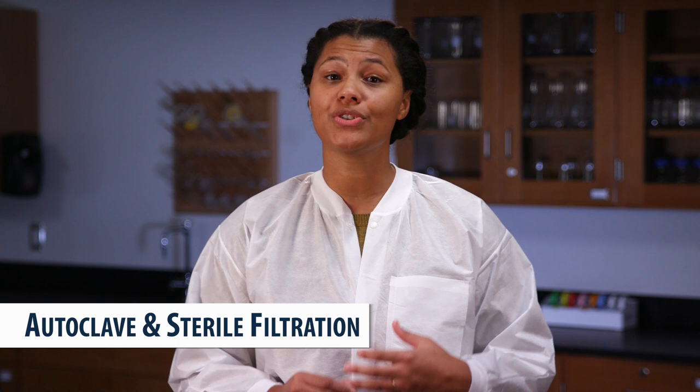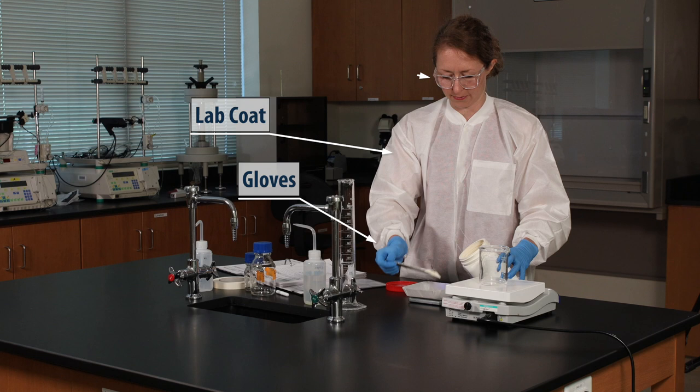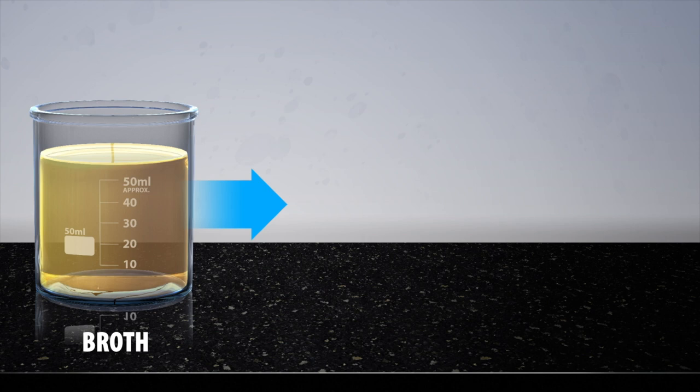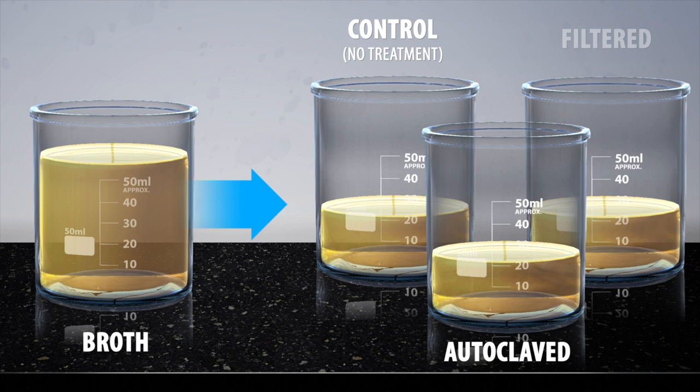Always be sure to wear your PPE, lab coat, gloves, and safety glasses. First, we're going to make a microbial growth medium that will split into three fractions. One sample will be our control. The second will go to the autoclave and we'll use sterile filtration on the third. Then we can check each sample for contamination and compare the results.